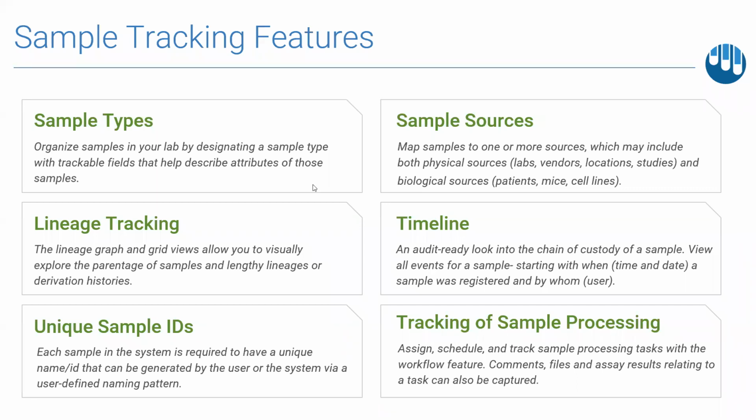Okay, so let me just screen share once again. So keep the questions coming as we speak, and we'll get to those as quick as we can. But as you can see from Steve's demonstration, even today, Sample Manager already has a very rich feature set of tools, and it's all accessible via a pretty intuitive web-based UI.